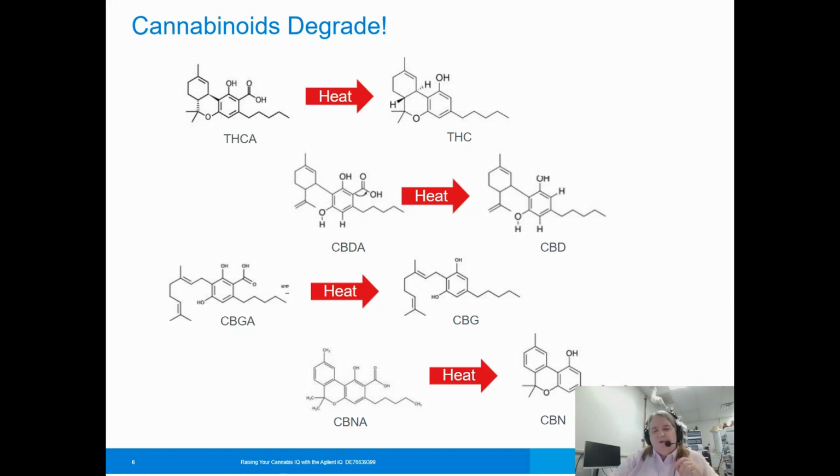So it's really important. You can do some GC work, as you're only limited by your chemical creativity. But as we go through this presentation, you'll probably find out that I'm the world's laziest chemist. If I don't have to do a lot of work, I really don't want to do it. Especially for those of you in cannabis factories, quality control or testing labs, it's all productivity, right? The more analysis you're able to run, the more productive you are.